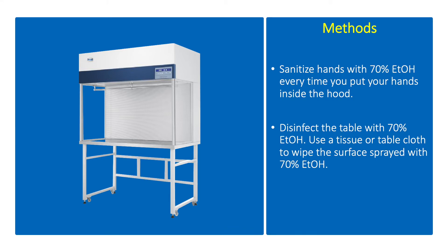Sanitize hands with 70% ethanol every time you put your hands inside the hood. Disinfect the table with 70% ethanol. Use a tissue or tablecloth to wipe the surface sprayed with the ethanol.